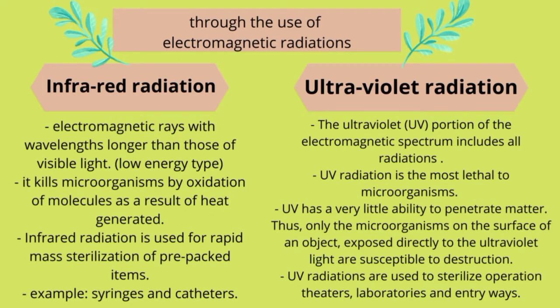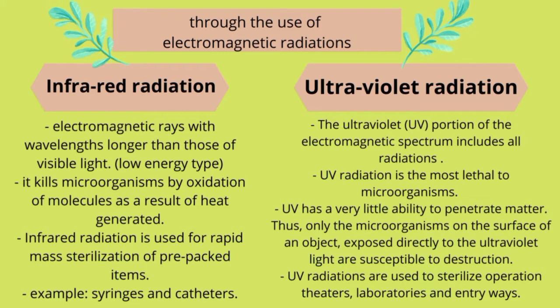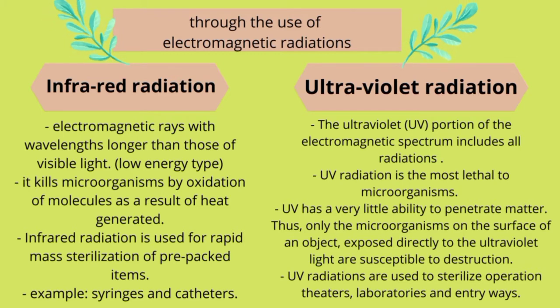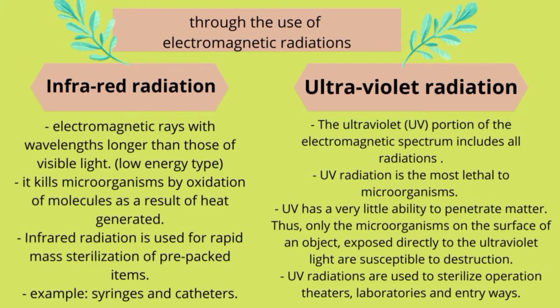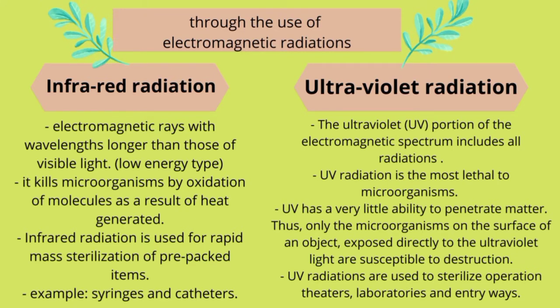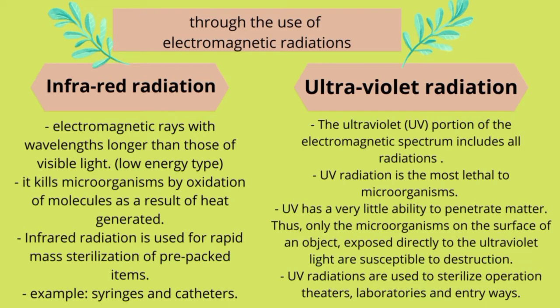Non-ionizing radiation is through the use of electromagnetic radiation. Firstly, I want to tell you about infrared radiation. These are electromagnetic rays with wavelength longer than those of visible light. These are low energy type. It also kills microorganisms by oxidation of molecules as a result of heat generated. Infrared radiation is used for rapid mass sterilization of pre-packed items such as syringes and catheters.